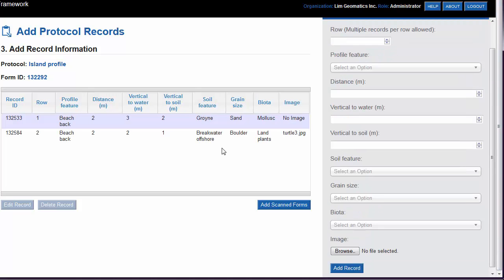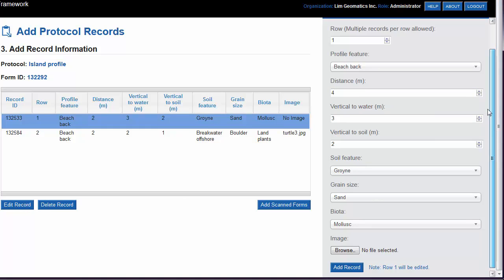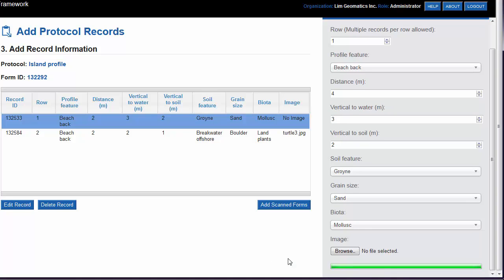If we've made a mistake, we can change it by selecting the record and clicking on the Edit Record button. The record information will reappear at the right-hand side. We can make the modification and then click Add Record again to make the change.